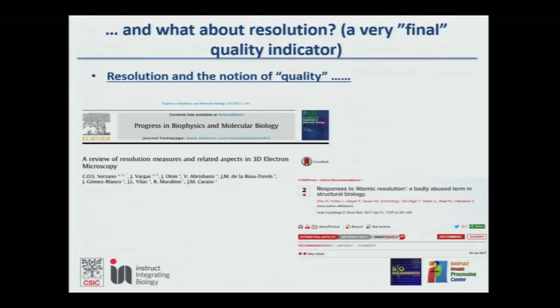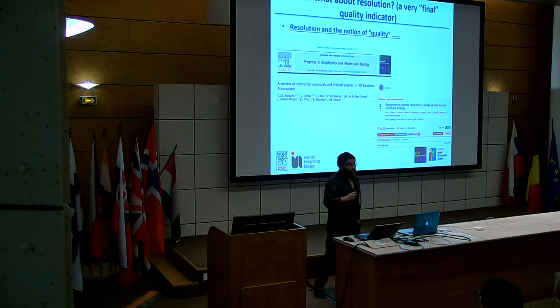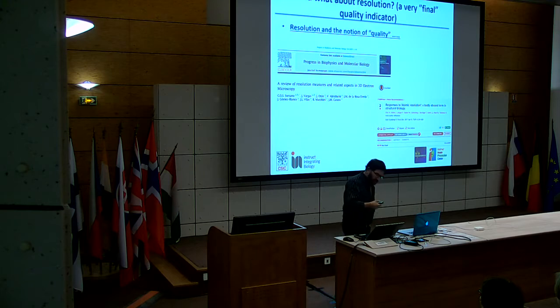Let me keep going with the subject of quality. Many of you could be thinking, why all this discussion about quality? Just tell me about resolution, and this would be enough. If you want to not sleep during the night, read this paper. Last year, it is, from our point of view, a very in-depth review of what we do about resolution from the mathematical point of view, the numbers we attach, the meaning of the numbers, and things like that.